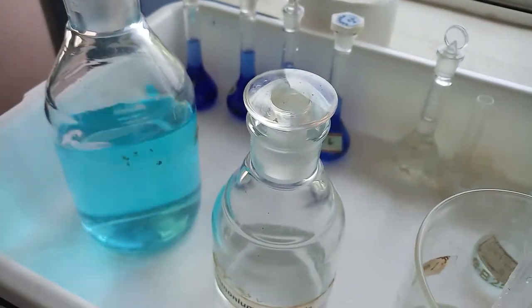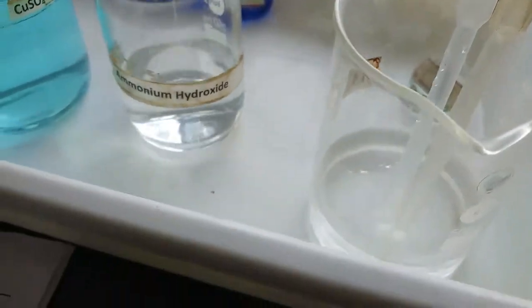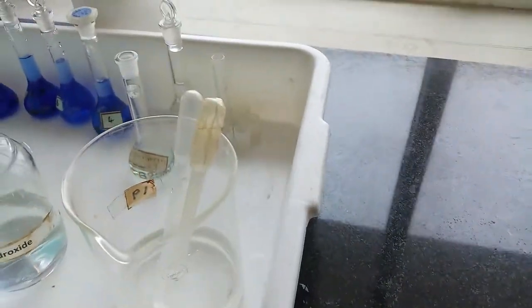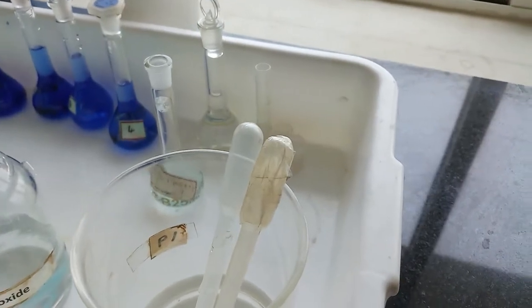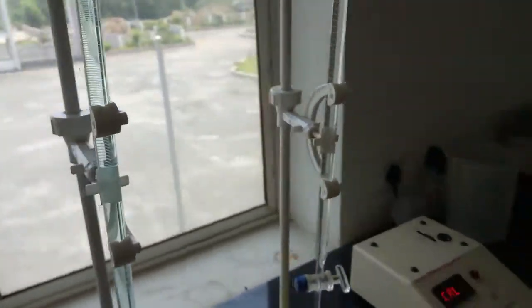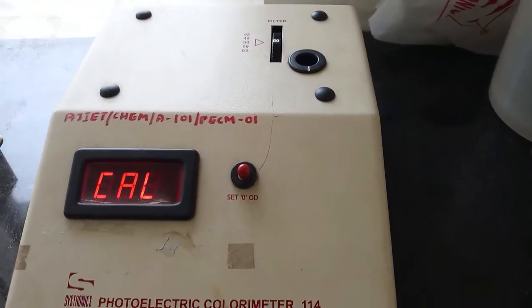Here we have the stock solution of copper sulfate. This is NH4OH, ammonium hydroxide, and we require 25-50 ml standard flasks — one to prepare the blank solution and others for the preparation of various concentrations of standard solution of copper sulfate. Separately, a burette is filled with copper sulfate and here ammonium hydroxide. This is the photoelectric colorimeter used to record the absorbance of the solution.